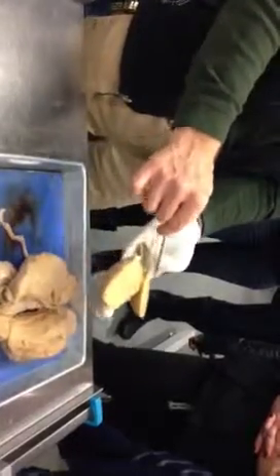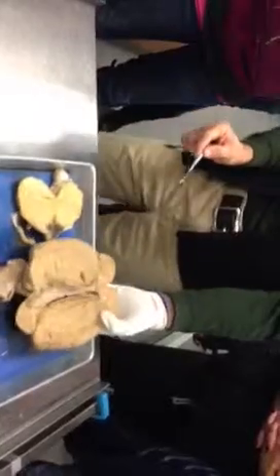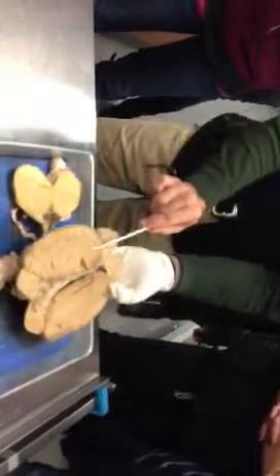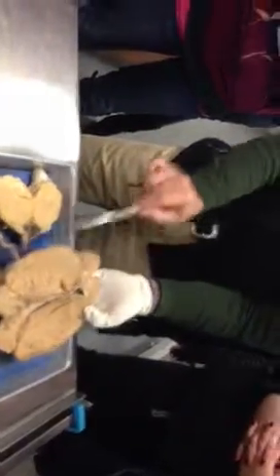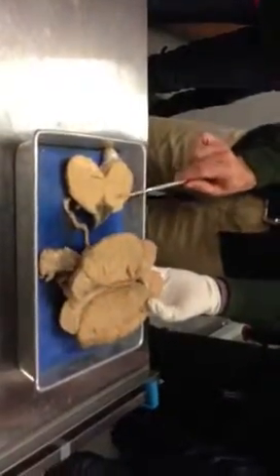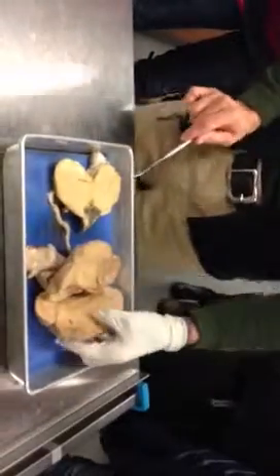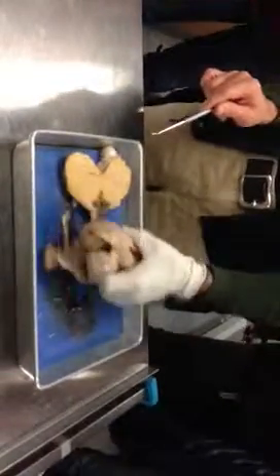That clearish white. Can you see it in the bull testicle? If you work at it, you can see it. It's there. See, some of it's here. You can see this area here. But that's the one we can see definitely better on the sheep testis. That's the rete testis.